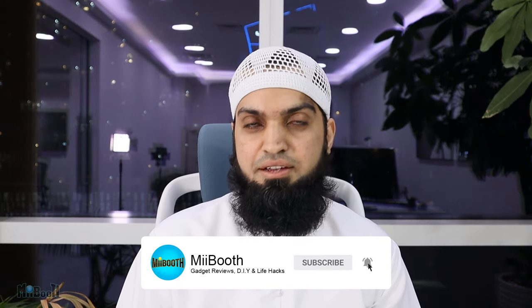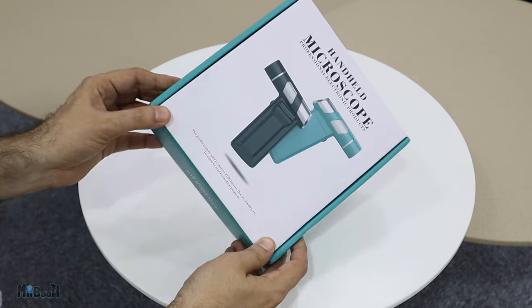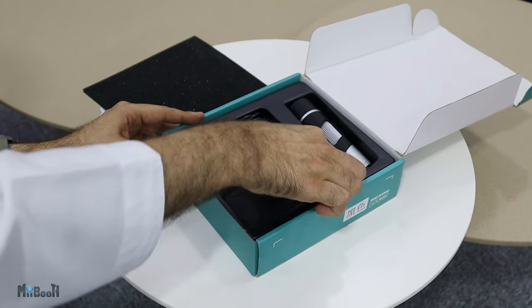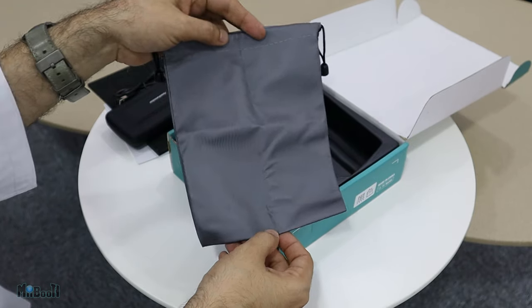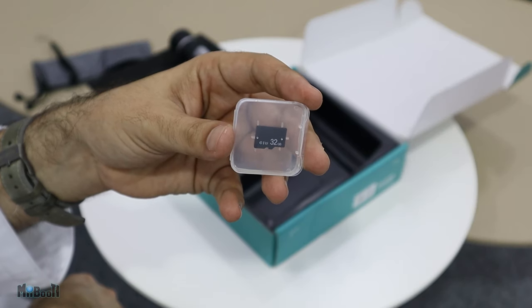Let's have a look at the package and then dive straight in to have a closer look at some of the samples I have lined up. This is the box, plain and simple. Inside, first off we have the user manual, and then below the foam pad we have the microscope itself, a charging cable still using micro USB somehow, a carrying pouch, a small lanyard, and finally a 32 GB memory card. That's helpful.